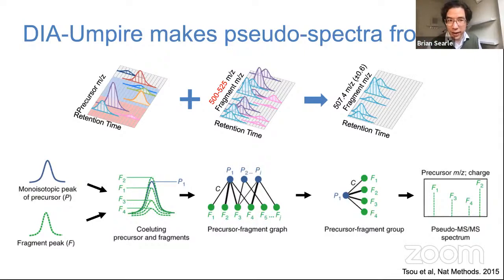Now this runs into a lot of the same problems, because it requires that you actually have a precursor signal that is accurate and representative of the shape of the peak, which we talked about earlier as not necessarily being a perfect scenario, and some of the things that DIA can resolve. But it is an approach where we say these particular precursors can be assigned to these specific fragment ions, and that lets us compute a pseudo spectra of fragment ions that have the same rise and fall as that individual precursor. And then we can send those through a normal DDA-like platform where we're analyzing data with Mascot or Proteome Discoverer or something like that.